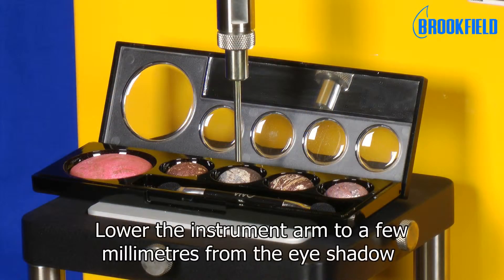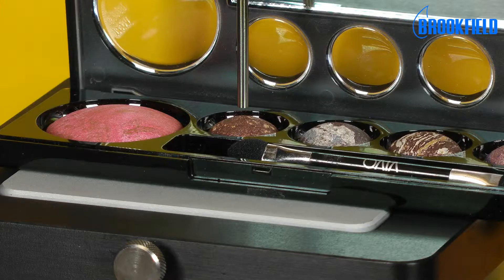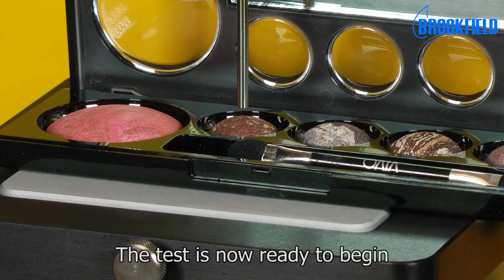Lower the instrument arm to a few millimeters from the eye shadow. The test is now ready to begin.